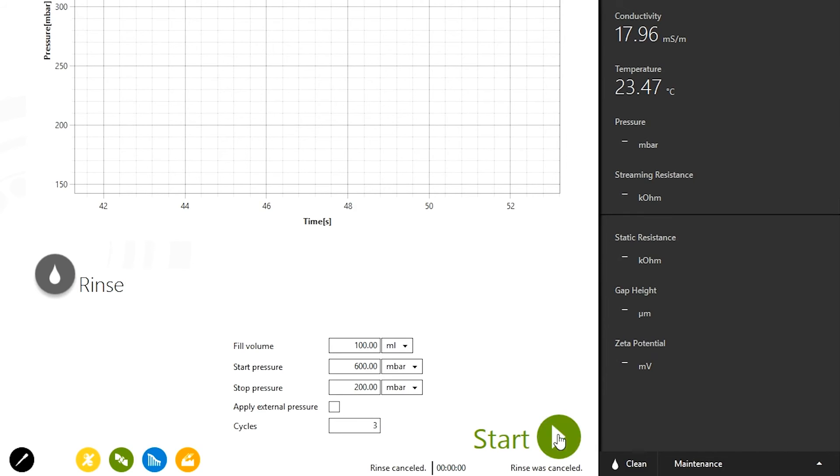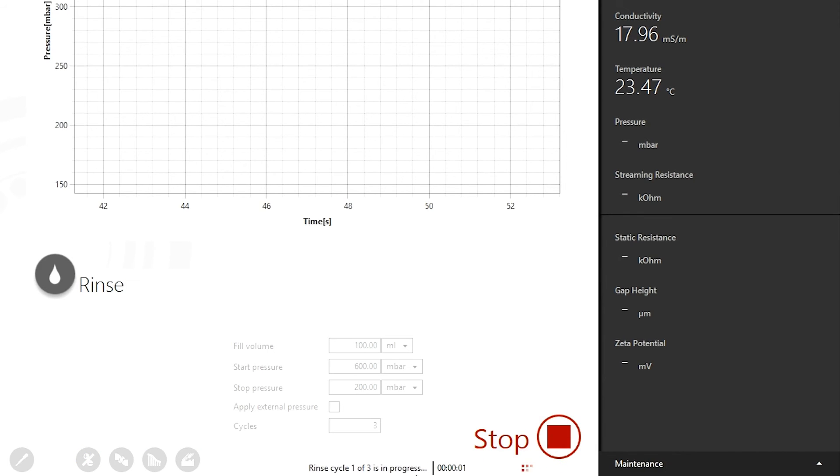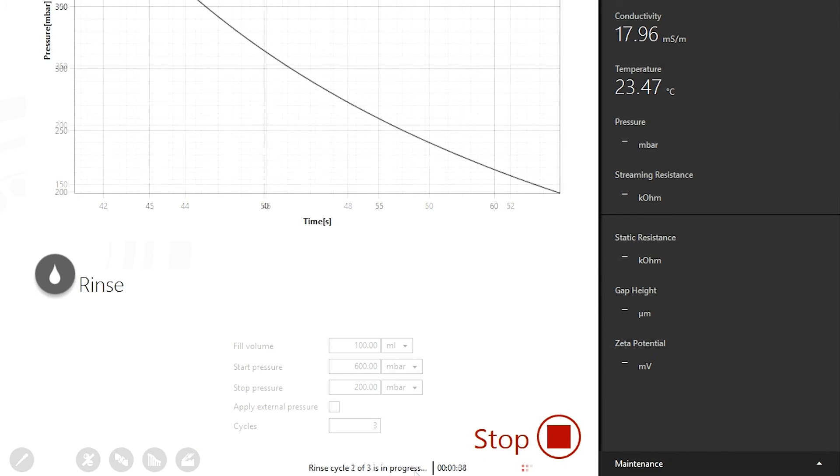Use the rinse cycle to adjust the gap between the sample surfaces while filling the cell with measuring liquid.